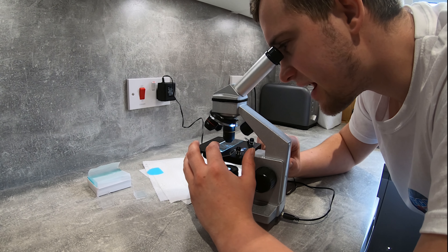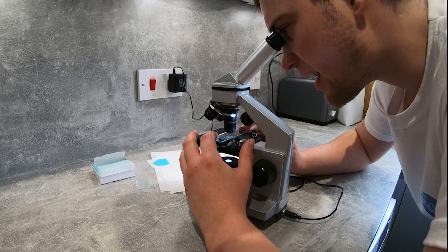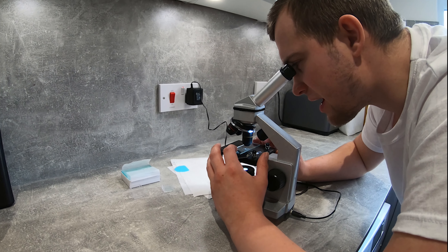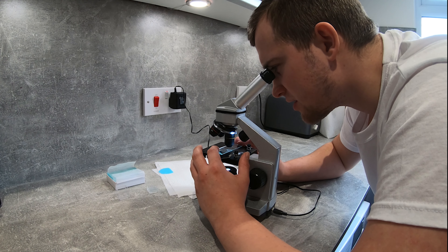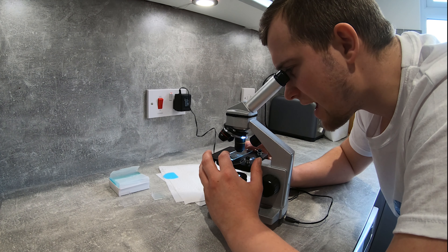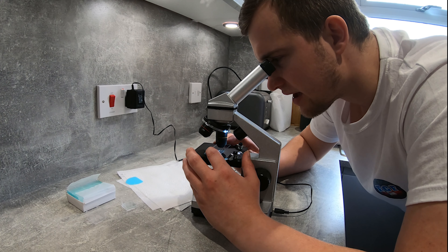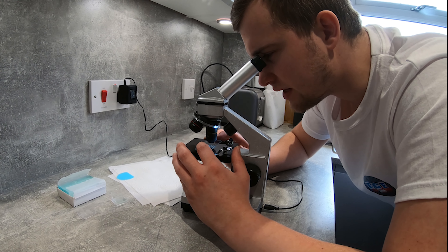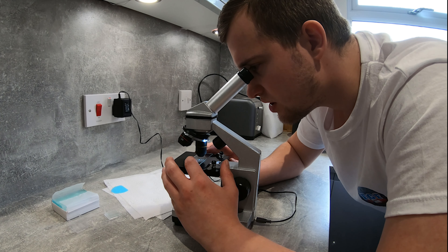I'm checking the mucus now. Unfortunately we didn't get a very good scrape, but so far I haven't seen anything moving about. I do have some videos of parasites I identified with this microscope on the channel from about three years back when I used to keep koi. I'm hoping I won't find anything and that the slight issues that fish was having were due to the eggs. I did manage to lightly massage some eggs out of the fish and they came out really well — and the fish is nice and happy now with no further issues.